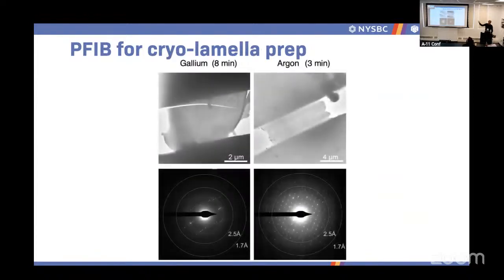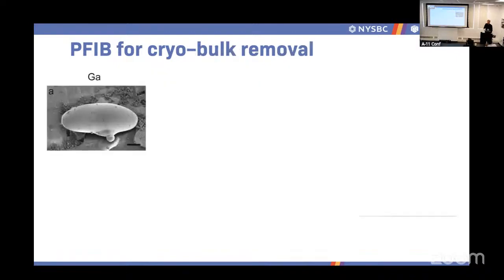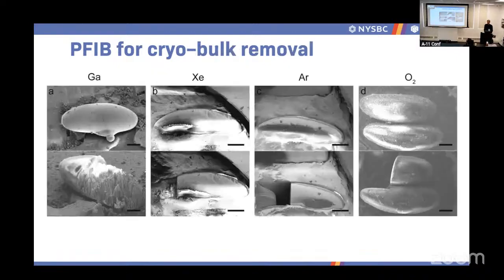Now, this is again something else. Ion implantation does deal with signal to noise. You'll be losing some of the spots. The spots are clear; they're just less visible. When you're using gallium, it does have a little bit of that effect. And if you're drilling through big materials, you will probably want a focused ion beam that has a lot of current. So look at that compared to gallium.